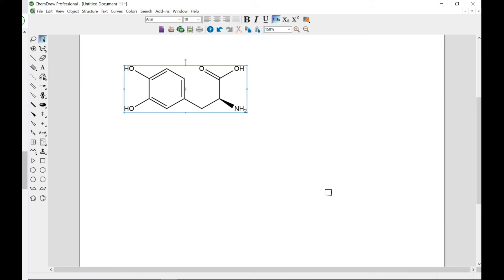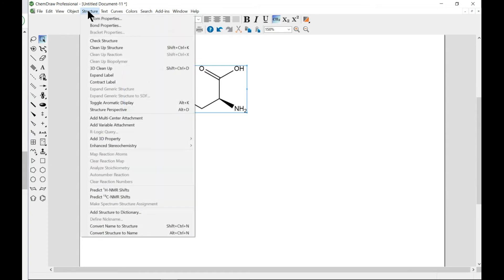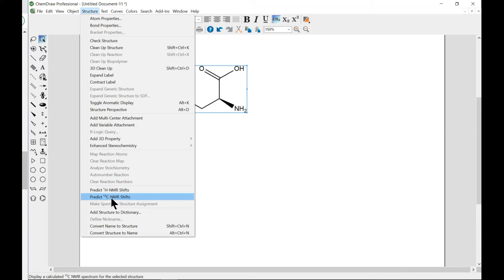Now ChemNMR also estimates chemical shift for all hydrogen and carbon atoms. So after you select your molecule, you can come to structure and you see predict the hydrogen shift and then the carbon-13 shift.